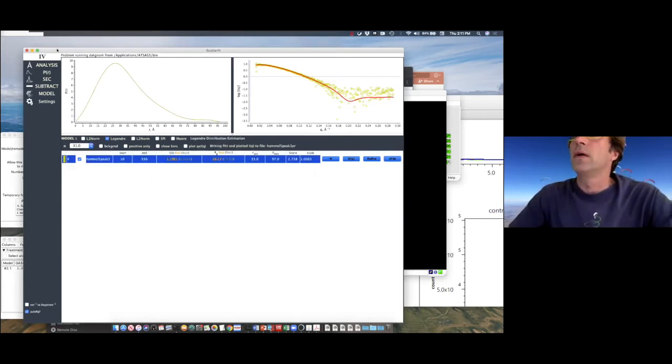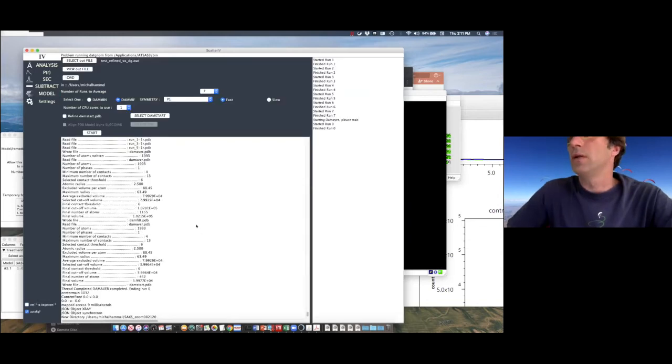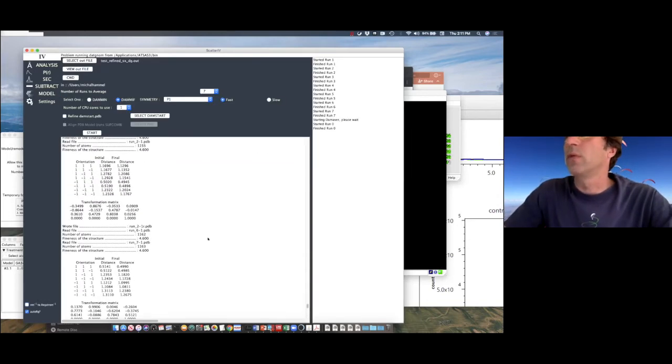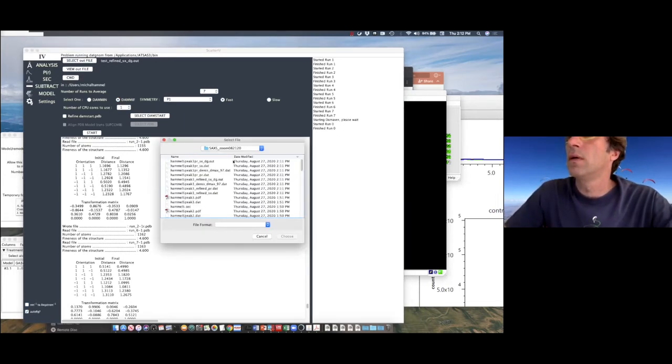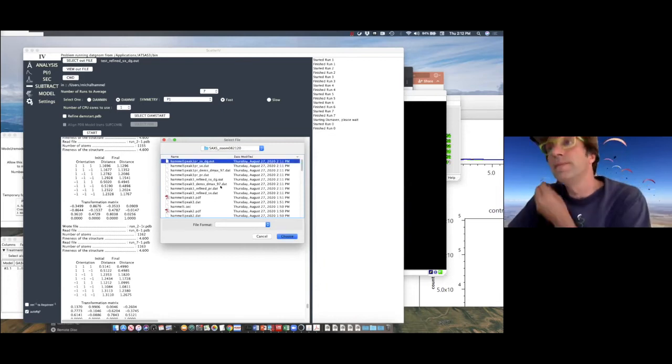And then you go to the model, and I run it to be sure that it's working well. And so you select your, okay, right, this one.